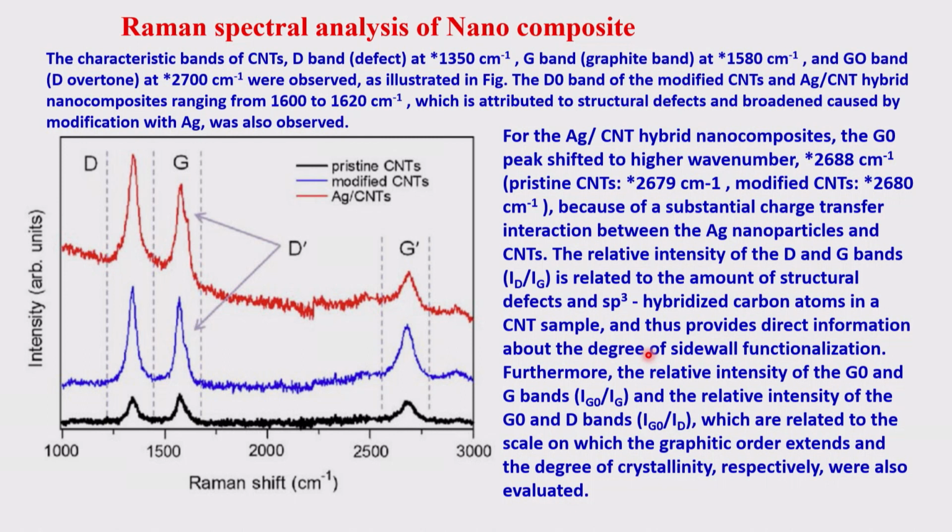Okay, both of these. CNTs can be slightly modified organically, because the functional groups will then connect to the silver nanoparticle, and the details of the frequencies are given over here. So the relative intensity of the D and G bands, as well as the nature and structure of each band, the side ones, and internal ratios like I_G/I_D, in the case of these bands.